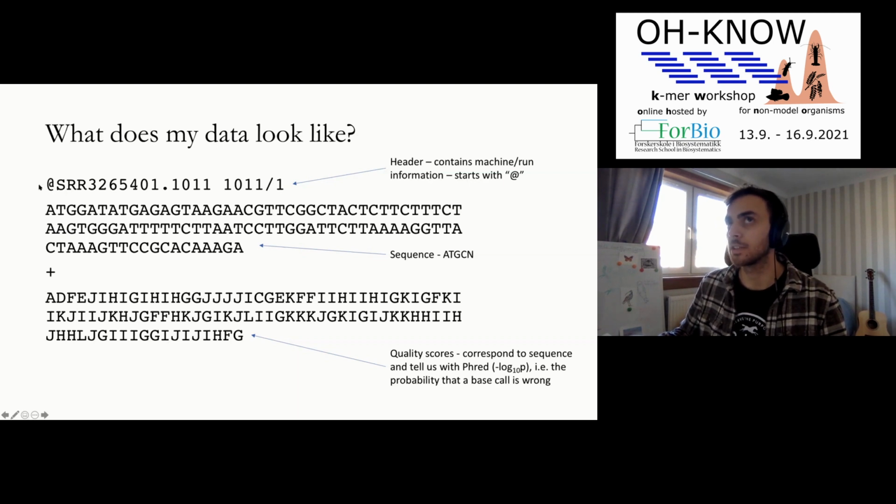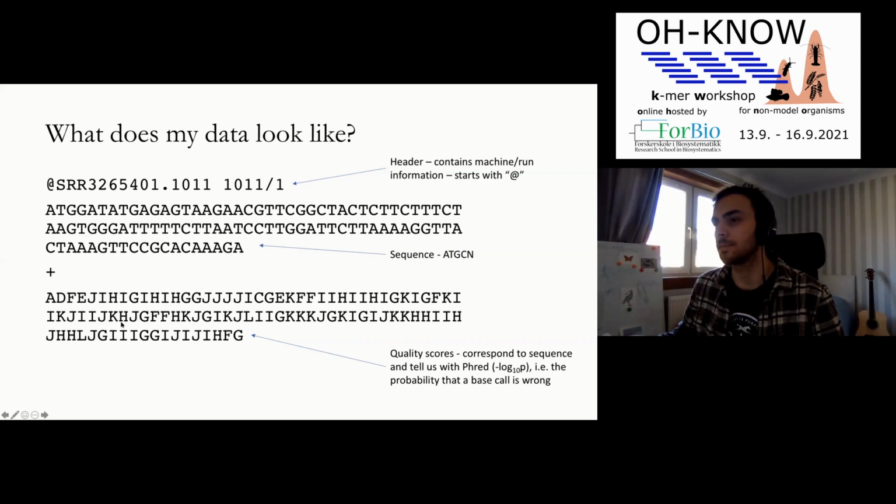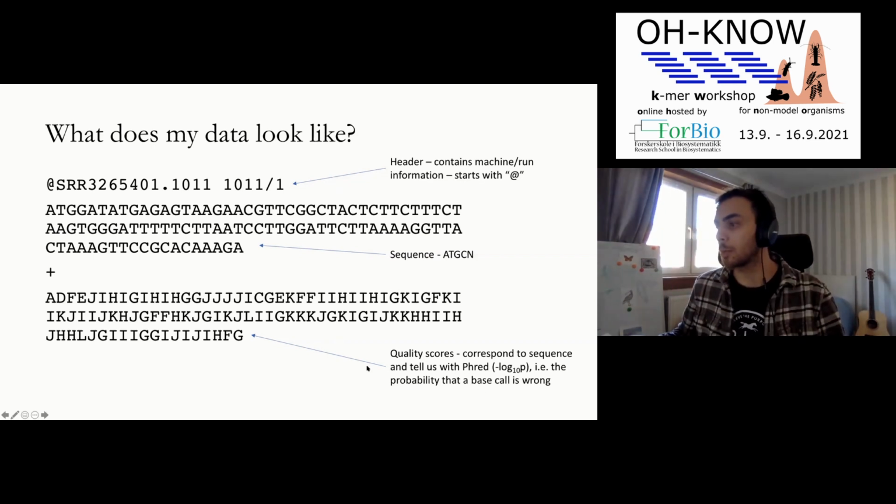This is a Fastq file. And then you'll have your sequence. Then you will have a plus, and then you will have a string that is your quality score. So in this example here, it's just letters, but there is a whole host of symbols. It uses the whole ASCII character library that's available. And each of these different characters corresponds to a Phred score. A Phred score is the probability that that base call is wrong. There are tables you can look up to see the conversion.